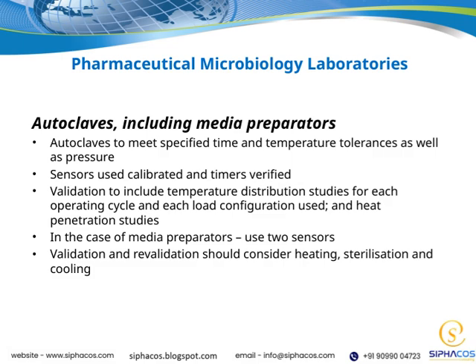Validation plays a key role here. It's not just about initial setup, but ongoing verification. This includes conducting temperature distribution studies for each operating cycle and load configuration, ensuring uniform heat distribution. We also perform heat penetration studies to confirm that sterilization reaches all parts of the load effectively.